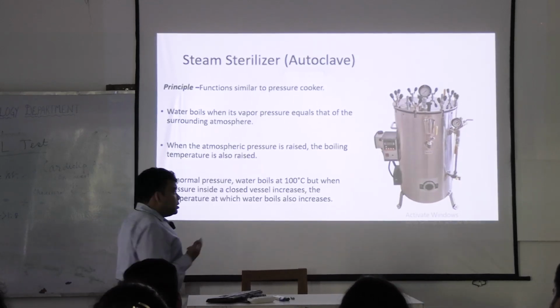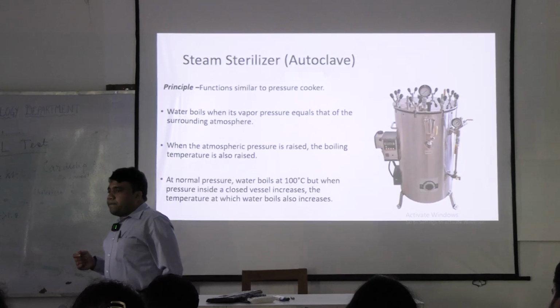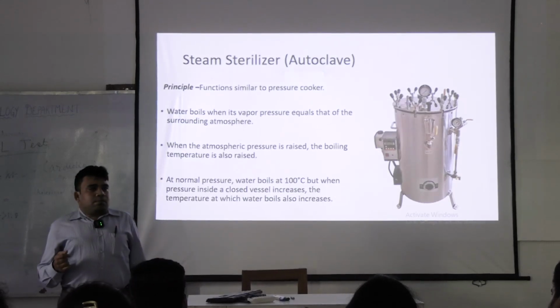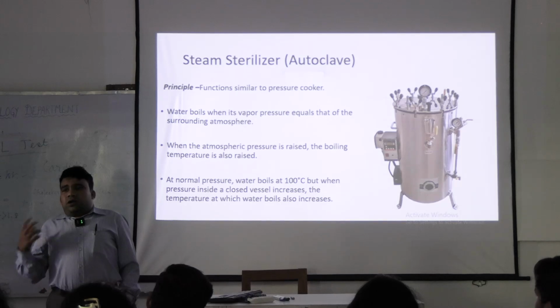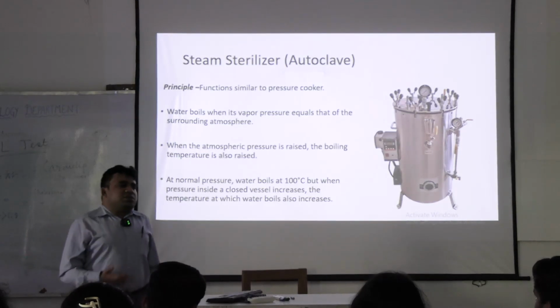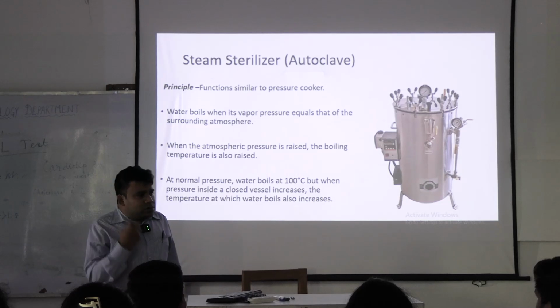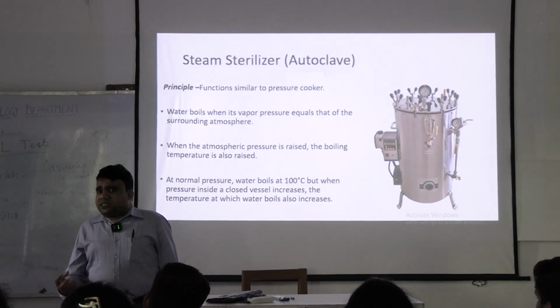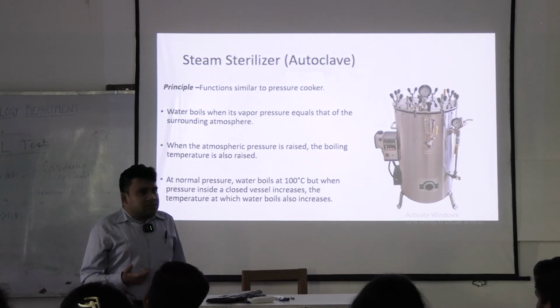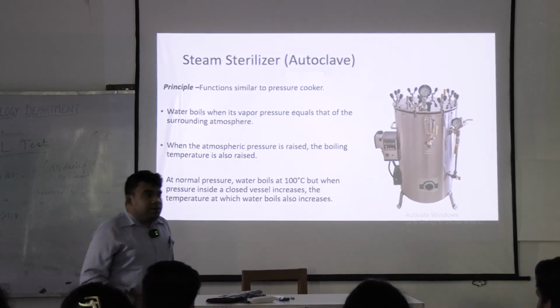What are the requirements? How does this act on microorganisms? How does the steam kill? When organisms come in contact with the steam, what happens? The steam gives off heat into the surface of the organism. Because of this heat, the organism dies. As simple as that.